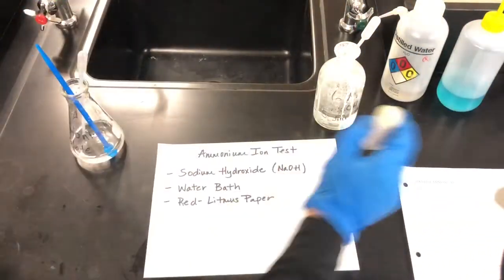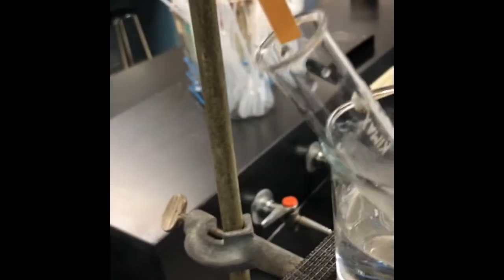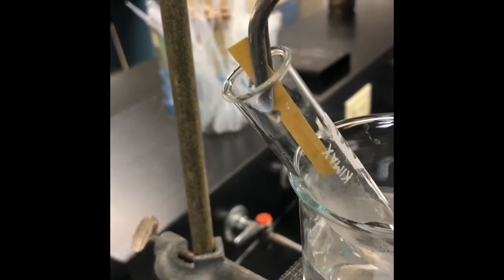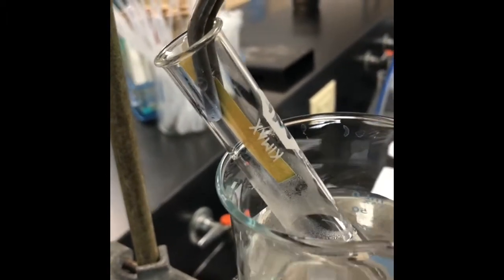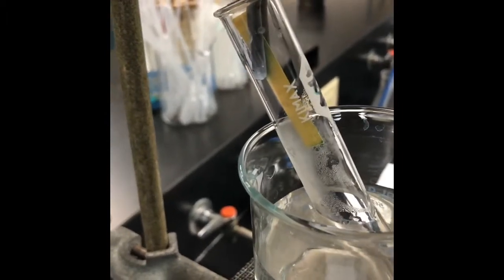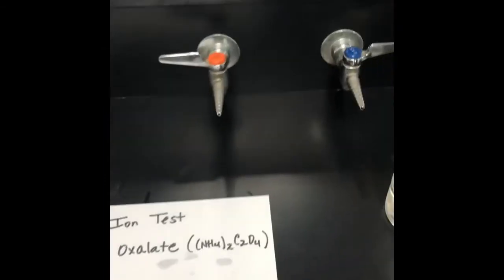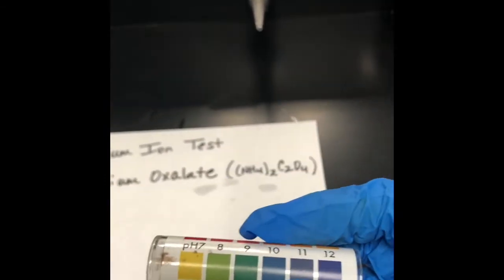Okay. Now it says we're going to do a water bath and we're going to test the pH of it. So I'm going to get me some pH paper. Okay. So I'm coming back and I'm trying to do this. Stick it down in there to test the pH. You can see the end of it is turning blue. It's producing some vapors. So that means that it's going to be a base. If we look at our pH paper, it says that it would have a pH of around 10.